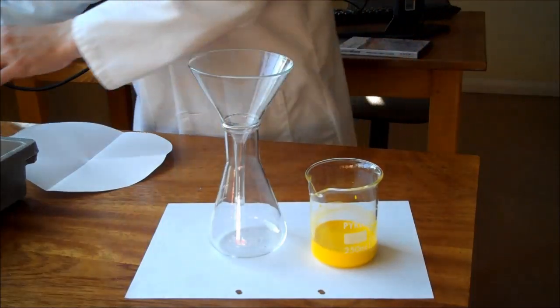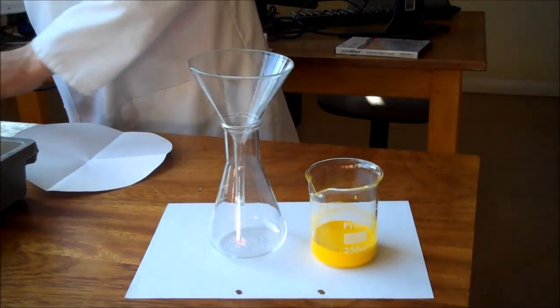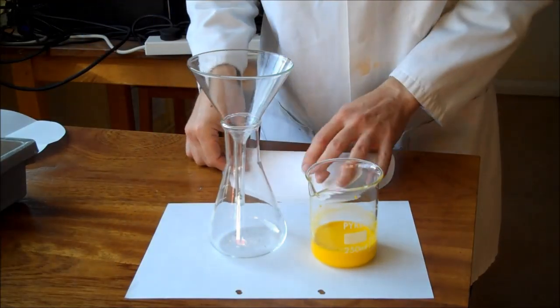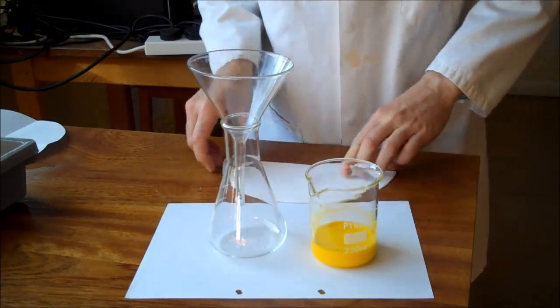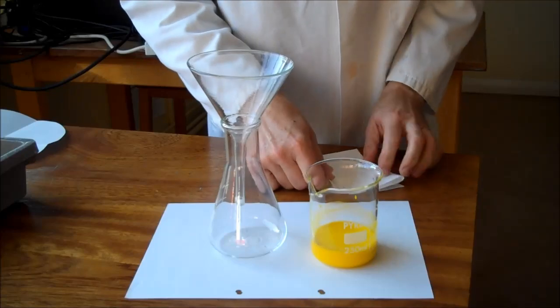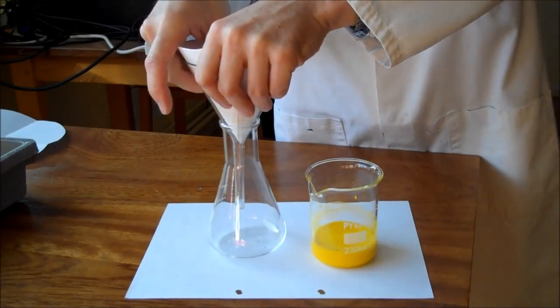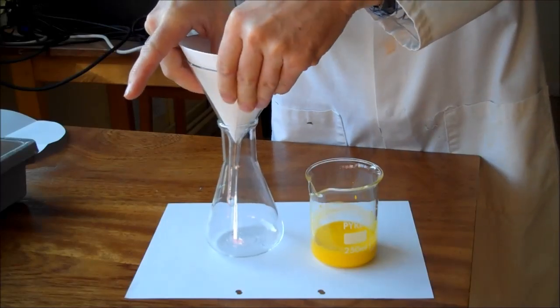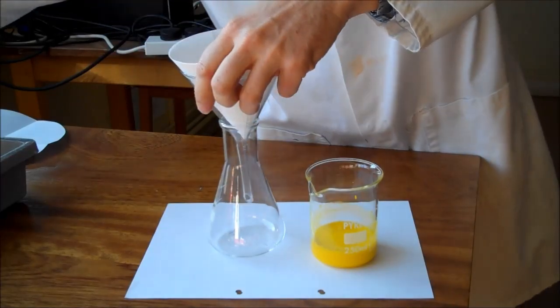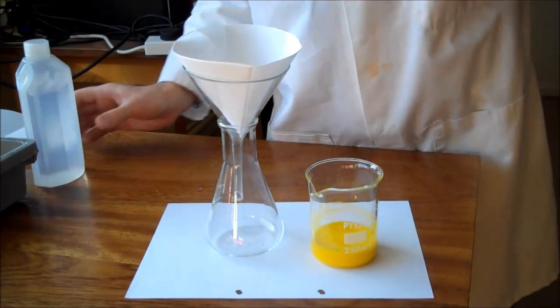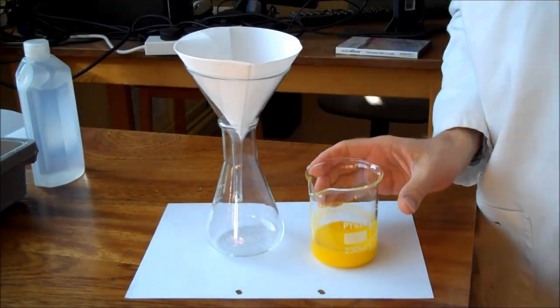Take filter paper, fold it in half, fold it in half again, and sit it in our filter funnel. To get it to sit properly you can sometimes just dampen it a bit so it sits in the funnel properly.